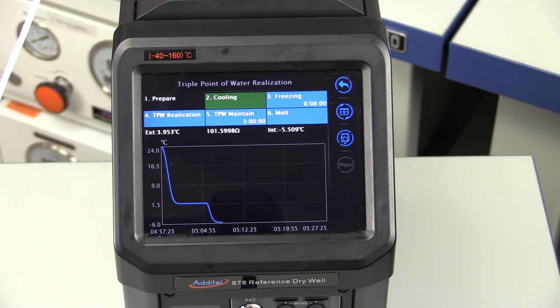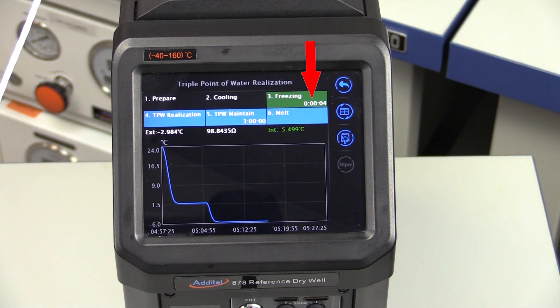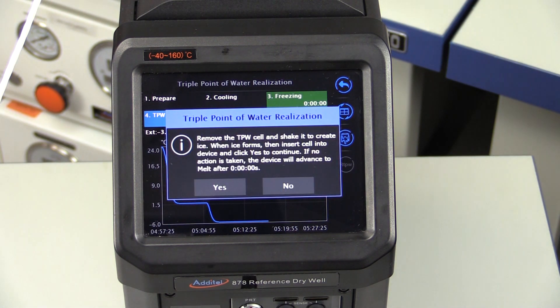The reference thermometer being tested should remain inside the cell during this process. When the cell is at the freezing set point, a 10-minute countdown will begin. Once the ADT878-160 has supercooled the cell, it will audibly beep letting you know when the TPW cell is ready to be realized. The ADT878 program will then count down for 2 minutes to allow you time to remove the cell and realize the triple point.